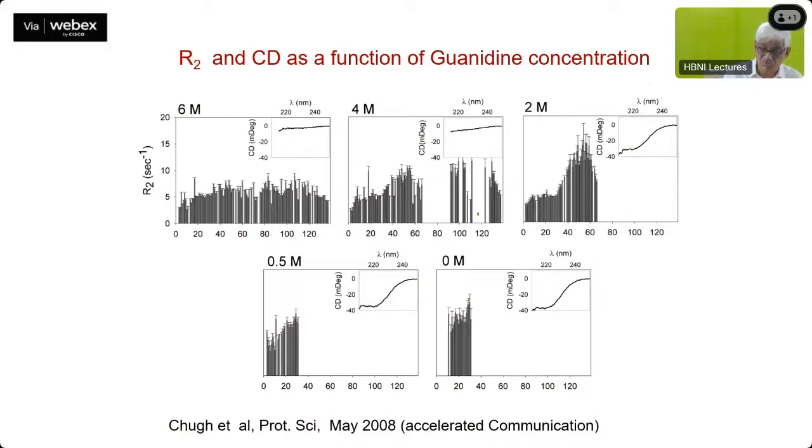Now we go to 0.5 molar, all these ones have gone, they also vanished. So stepwise you can see the R2 increasing, which means the line is getting broader, right? If R2 is increasing, the line is getting broader. So it is getting ready to aggregate. Stepwise they are getting ready to aggregate into a larger assembly.